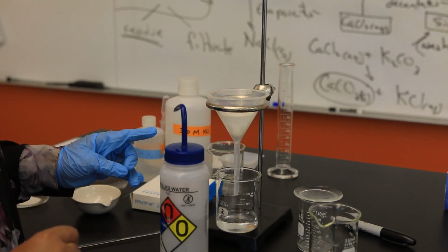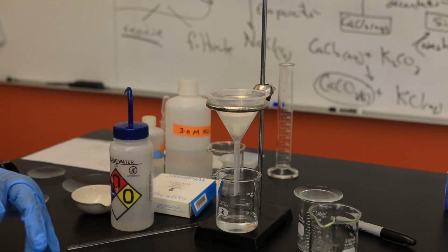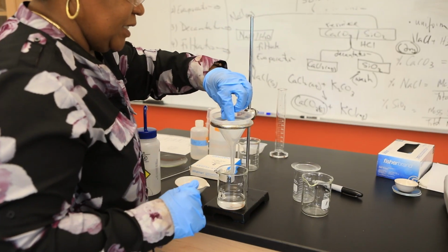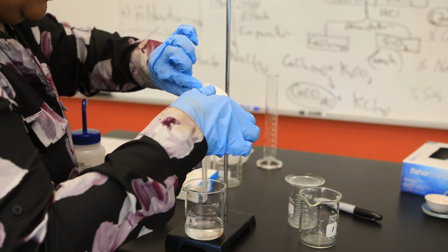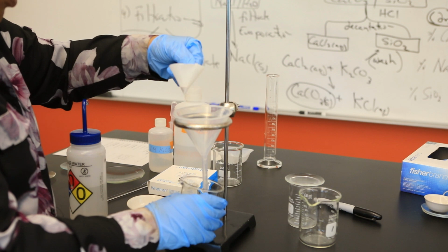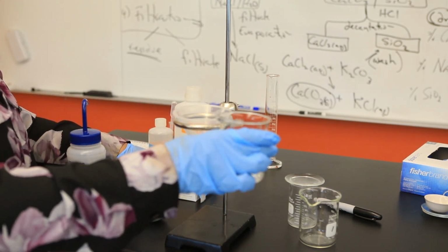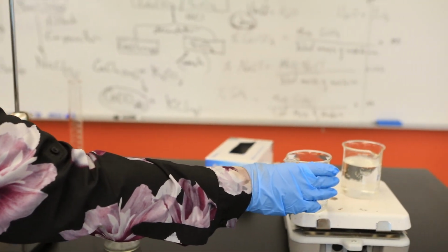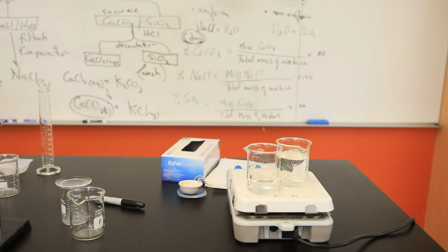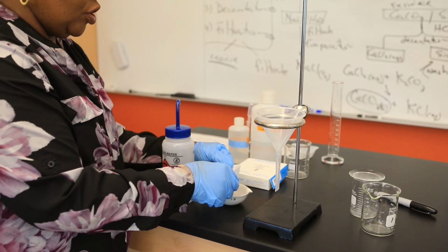Hopefully in a few minutes this will stop, and I should also be able to show you the residue on that paper. Alrighty, so what we're going to do next is remove the filter paper with the residue. I'm also going to remove my beaker. Don't forget, this is beaker 2 with my salt water solution. I'm going to place that directly on my hot plate. We'll allow that to boil while we move on. What do you think is going to happen? The water will evaporate, don't forget, and we'll be left just with salt.